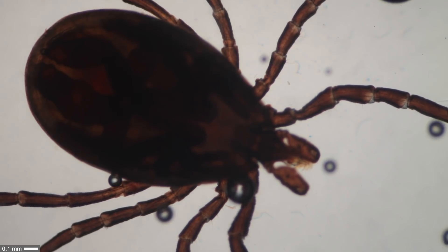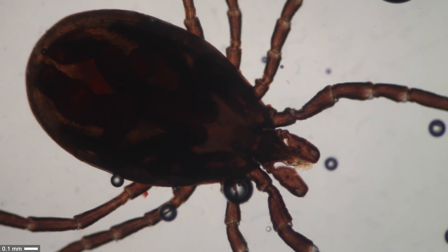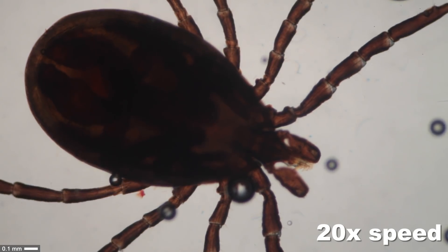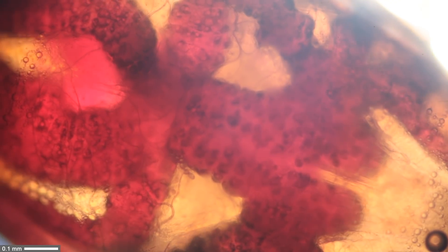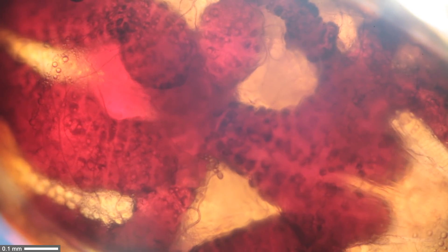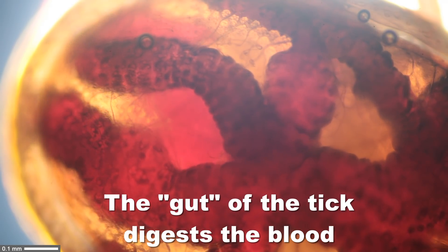Sure enough, it continued moving under the microscope. You do see a couple of round air bubbles. This is a bright field image, meaning the background is white and the tick itself is dark, so the organs can barely be seen. At higher magnification with adjusted exposure, I could look into the tick and see the organs moving. There's a scale bar in the lower left corner — I calibrated the optics and included it as a side note. Those dark red structures in the abdominal part may actually be the parts that contain blood, and the organs are contracting and expanding.